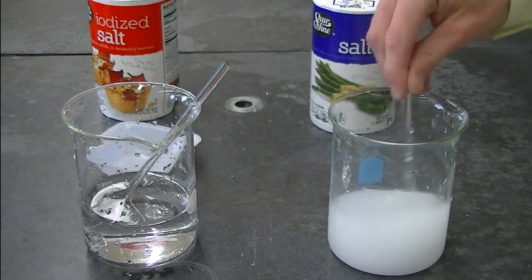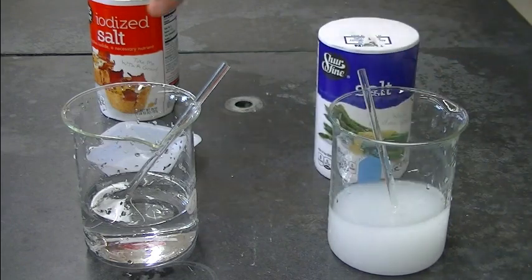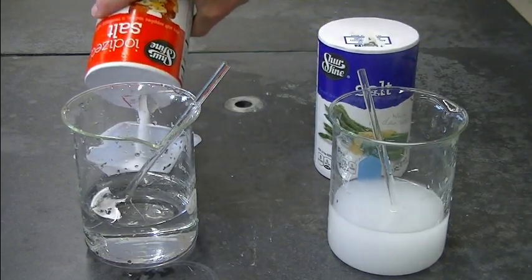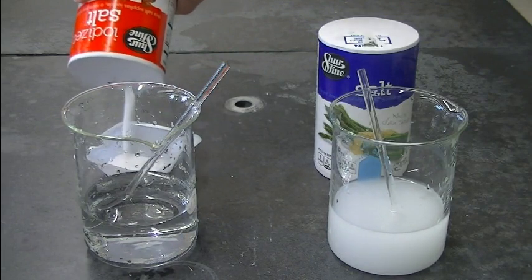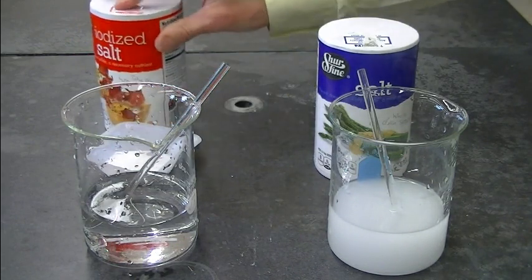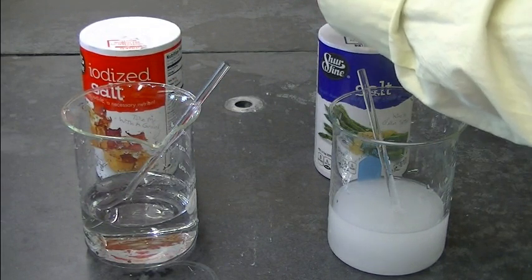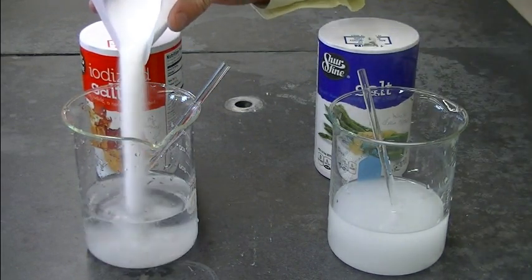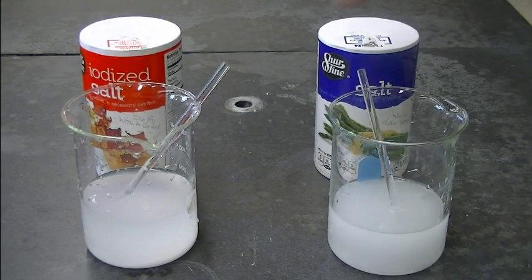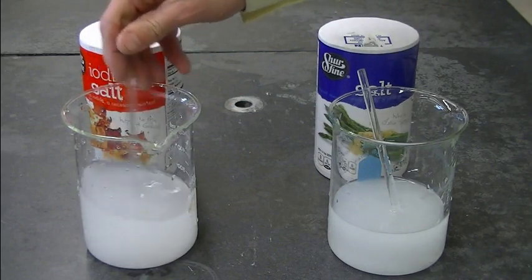The sodium chloride will mostly dissolve. To the other beaker we're going to add iodized salt, which contains mostly sodium chloride but also 0.006% added potassium iodide — that's 60 parts per million if my math is correct. Not much.